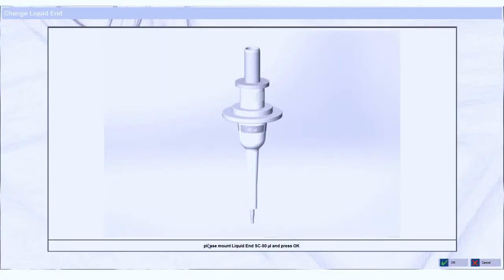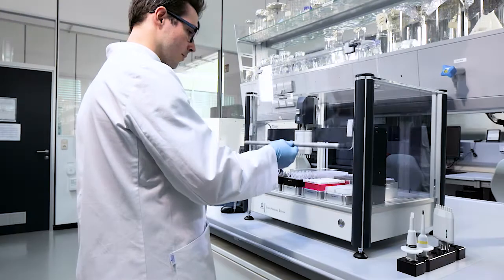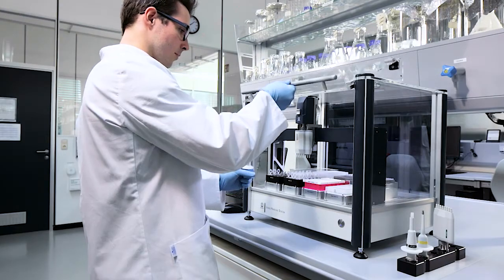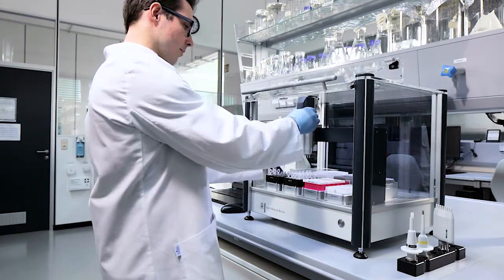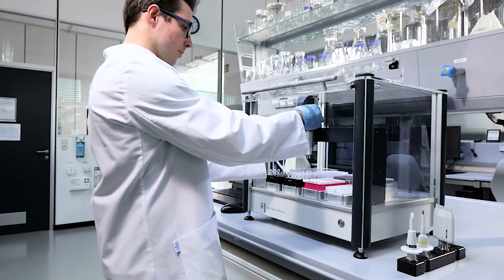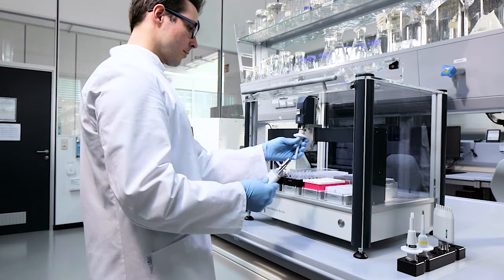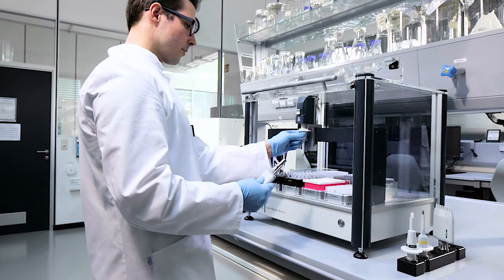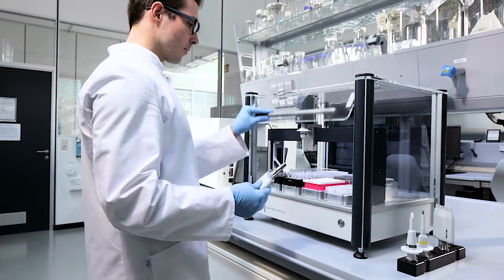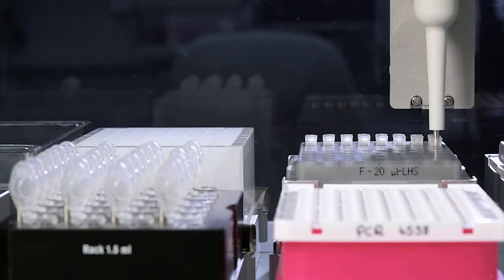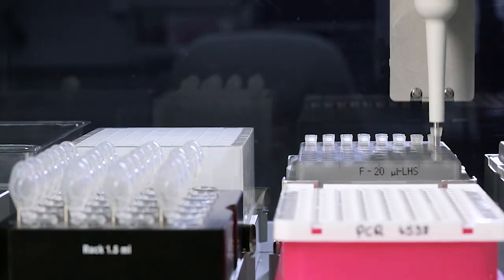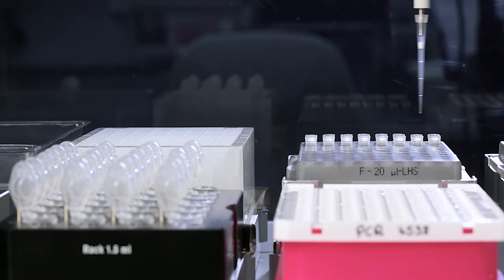There are single channel and multi-channel liquid ends available. You can change the liquid ends without any tools. Simply press the button, take out the liquid end, put in a new one and continue pipetting.